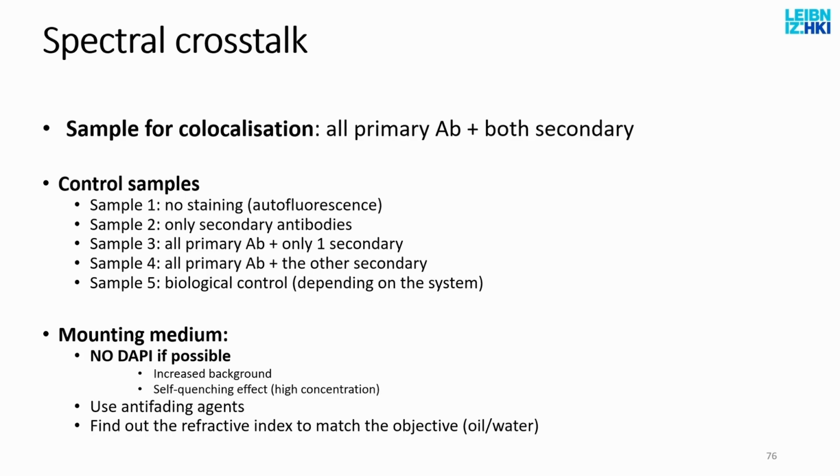But then, if I put oil here, there is no error introduced. The light doesn't even know it's in a different medium. So the sample is close to the cover slip, oil immersion, typically. If the sample is thick and I focus deep, match the refractive index of the sample.